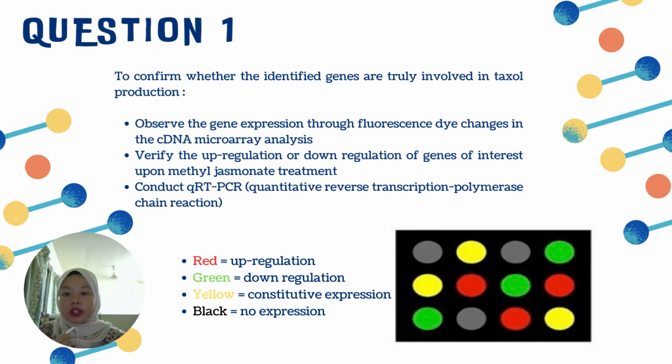So, in order to confirm whether the identified genes are truly involved or not, we can observe the gene expression through fluorescent dye changes in the microarray analysis. We can also verify the upregulation or downregulation of the gene of interest upon the treatment.